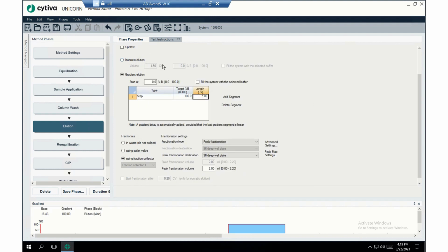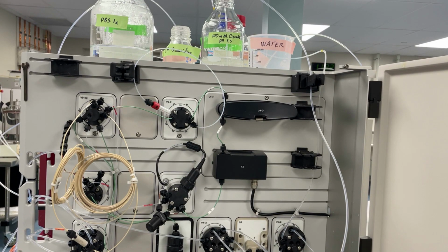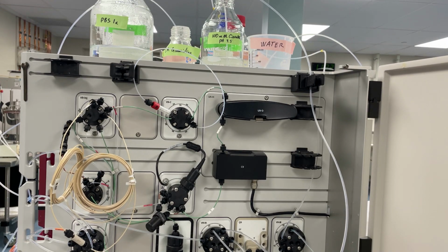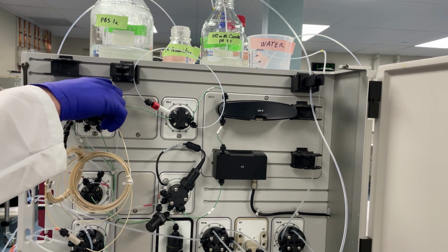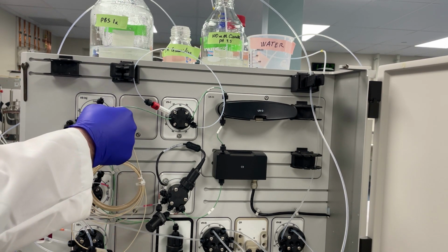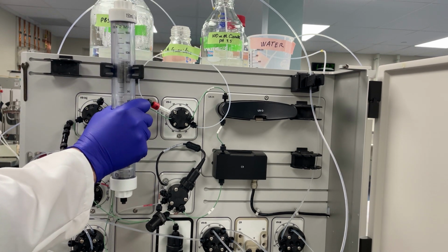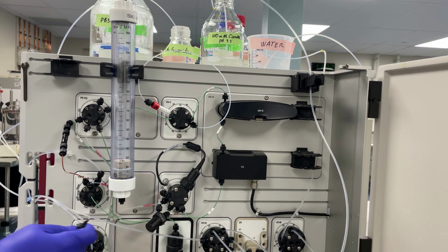Great. So now we need to make sure we go through the scouting procedure in the start protocol. So we'll hit this in the start protocol and we'll click on scouting. Okay, and we're good to go. Now we're going to put the super loop onto the system. The super loop will hold all 150 mils of cell harvest that we're going to need for this scouting run. We'll take the capillary tubing that we used in the last run off, attach the super loop onto the system.